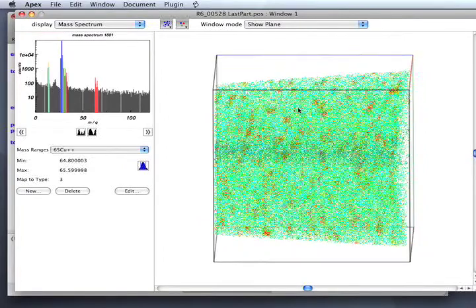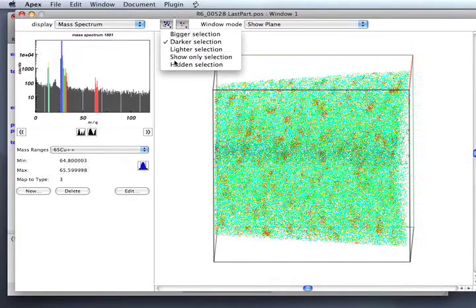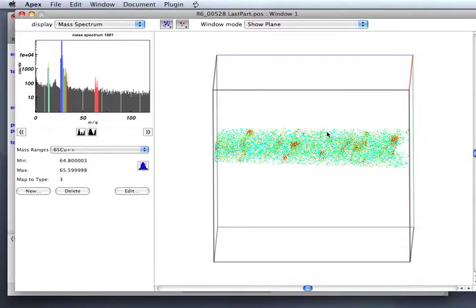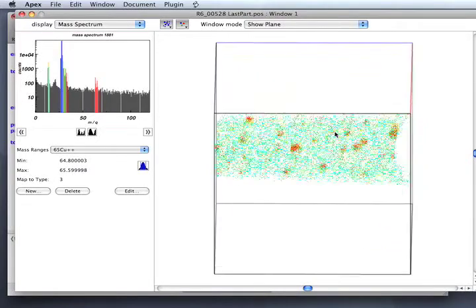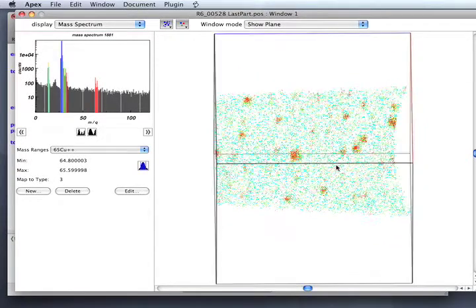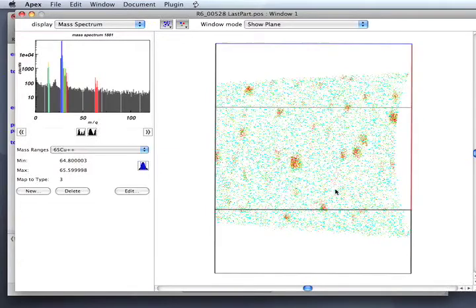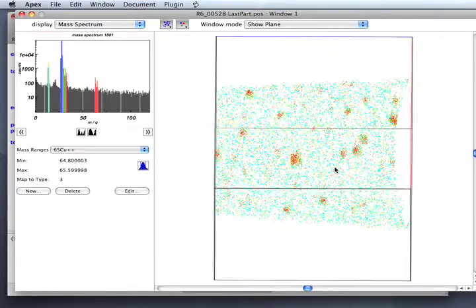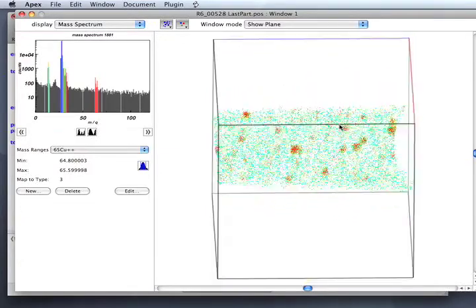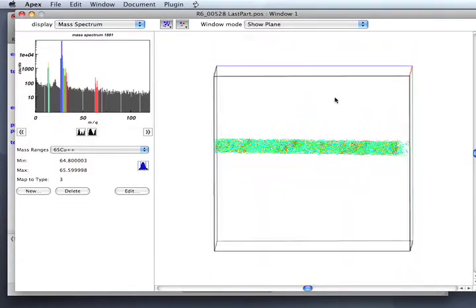I'm going to choose the item to show only the selection, that is only the items in the plane. You can see this particular sample is copper precipitates in an iron alloy.